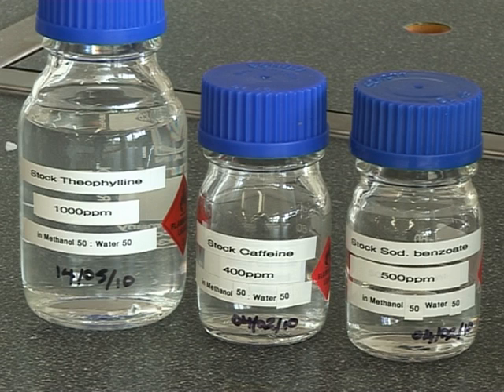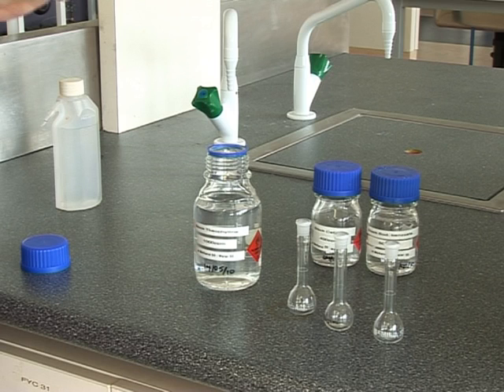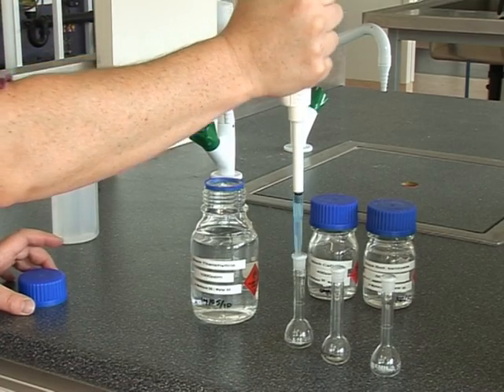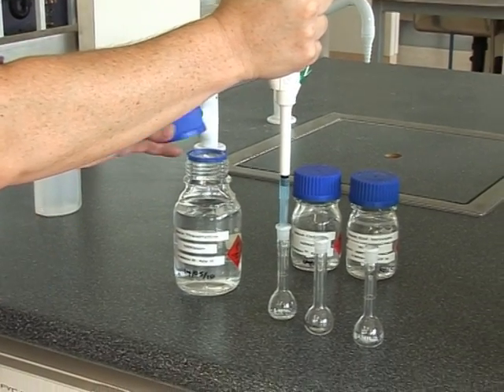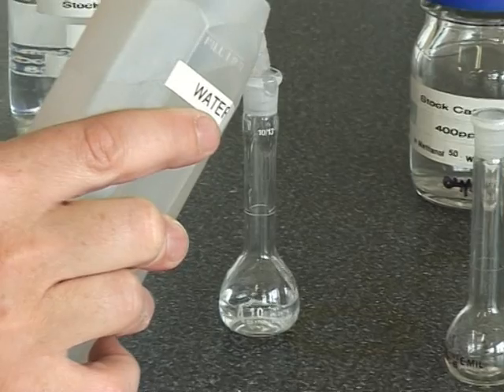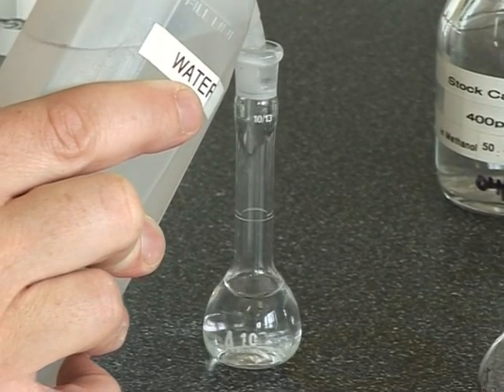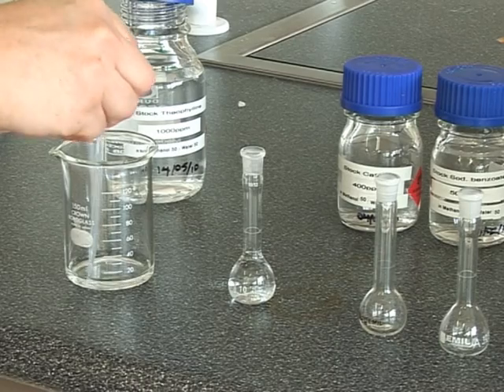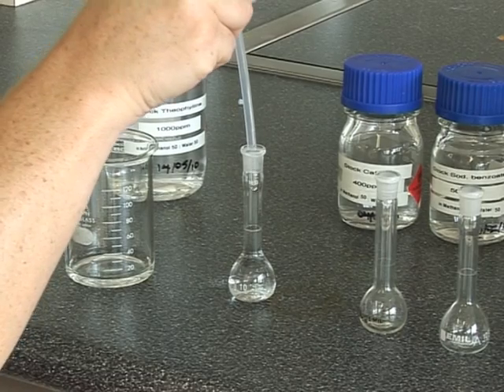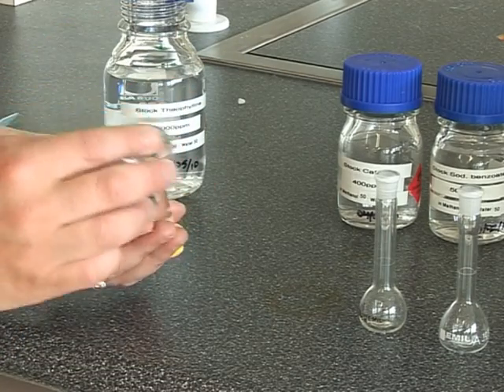From these stock solutions, you'll be required to make a 1 in 10 dilution from each standard solution. Obtain 3 10 milliliter volumetric flasks and label them with the appropriate standard. Using an auto pipette, take a 1 milliliter aliquot of the standard solution and dispense it into the corresponding 10 milliliter volumetric flask. Fill the flask up with distilled water until approximately 1 centimeter under the calibrated mark. Using a bulb pipette, make up to the mark dropwise until the bottom of the meniscus sits just on top of the calibrated line. Mix well.